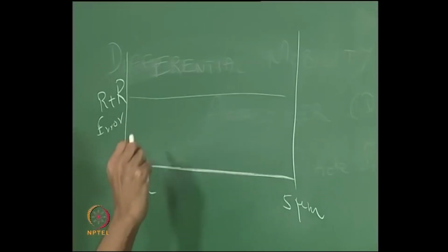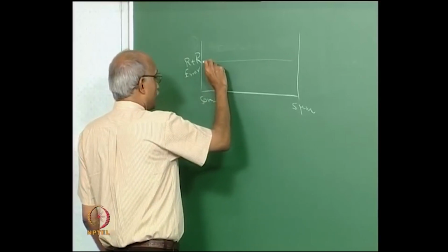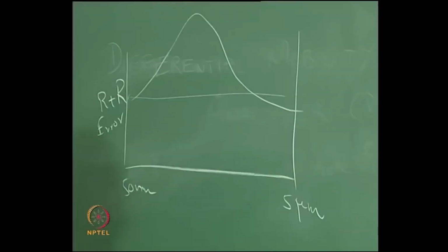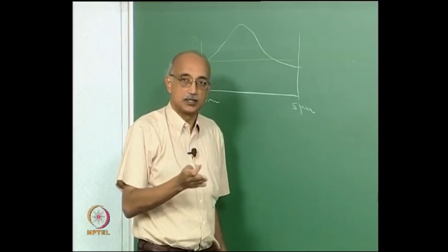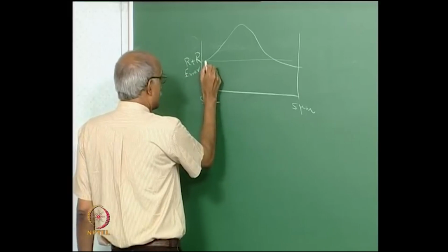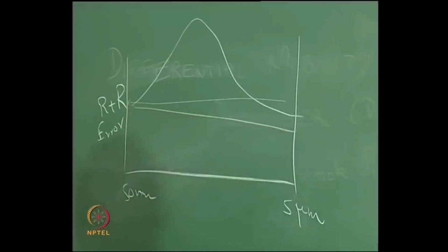However, it should not exhibit highly nonlinear behavior. In other words, you should not see a trend where there is a huge spike in this error at some value and then it drops off on either side of that value.